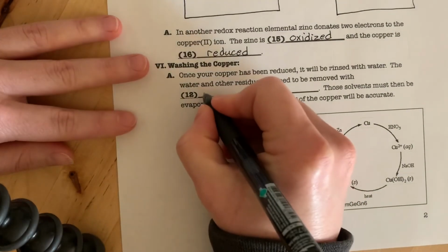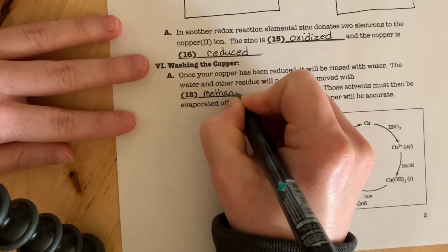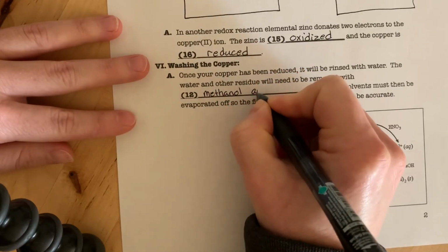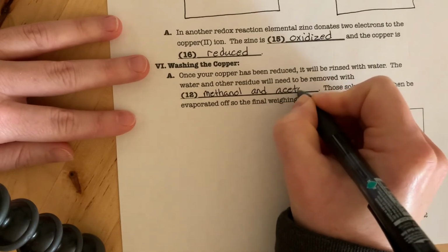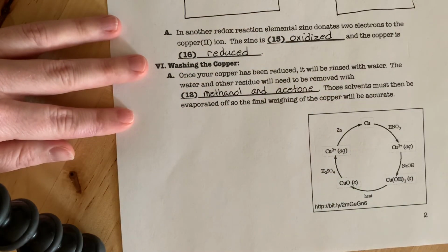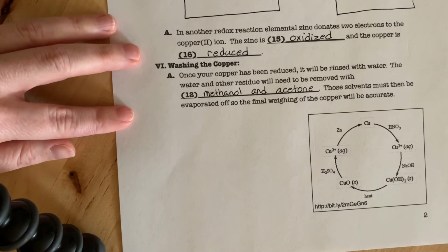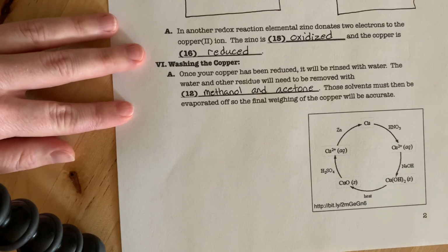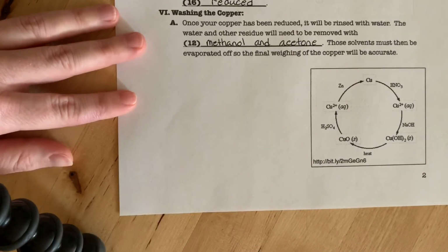And for that, we're going to use methanol and acetone. Those are both solvents that evaporate fairly quickly. And so those end up rinsing off and displacing all of the water and then evaporating, leaving you a dry product that you can then weigh out.